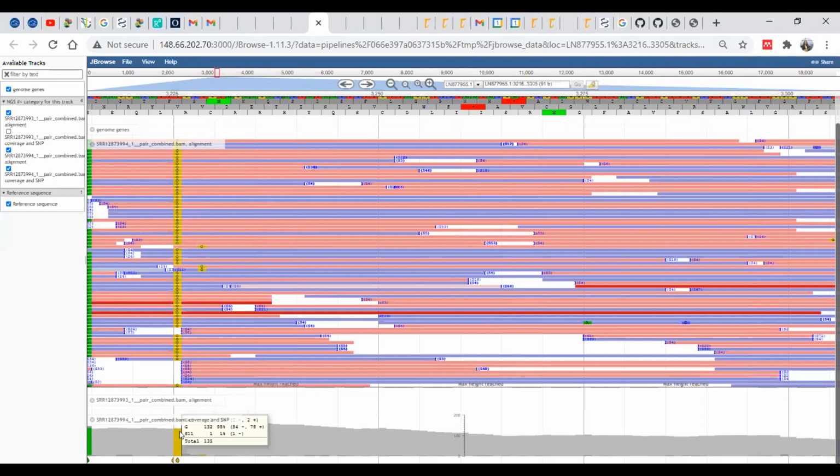If you go through the whole sequence alignment in the result, you might be interested in individual reads, but most likely you're not going to be interested in seeing all of the data. You're likely to only focus on the differences from the reference genome, and those are highlighted for you in this visualization so that you can easily spot them.